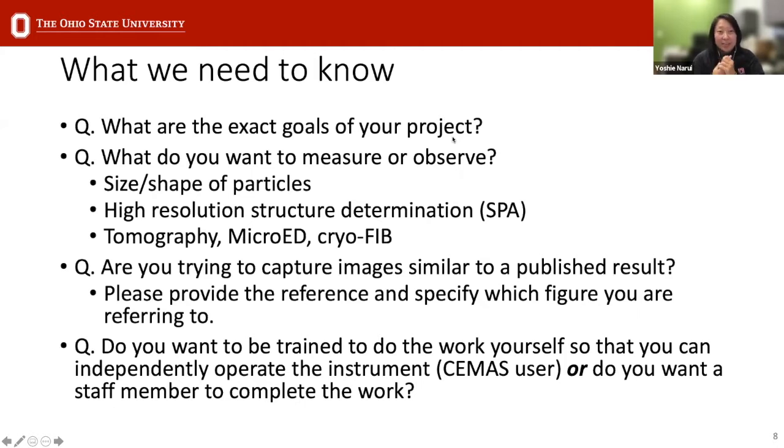So I'm just going to go ahead and assume that some of you are interested in becoming a CEMAS user. So you would like to operate the instrumentation on your own, you'd like to make your own grids, that sort of thing. So I'm going off that assumption. So the following slides will address how that process works. So I just want to outline it so it's clear to everyone what the steps are.